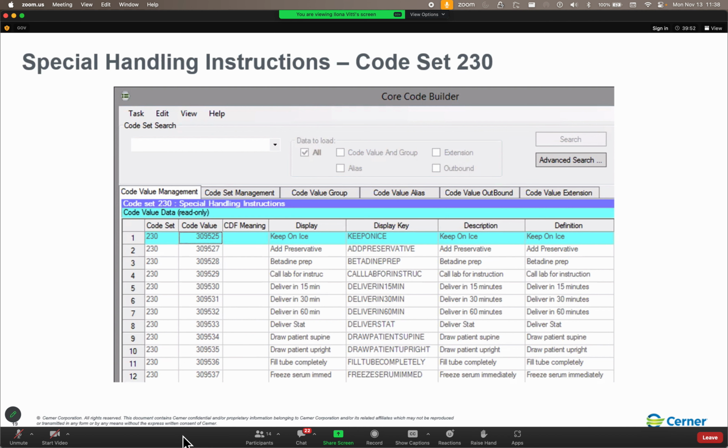But let's say that this was a real domain and we have a really bad day, or a really bad set of months. Go ahead and think about mid-2020. You've got high patient census, and a lot of lab tests being run on all of those patients. So what happens with that 10,000th accession number of the day? Does it error out? Do you get an error message on the front end? No, I'm sorry, I can't assign the accession number.